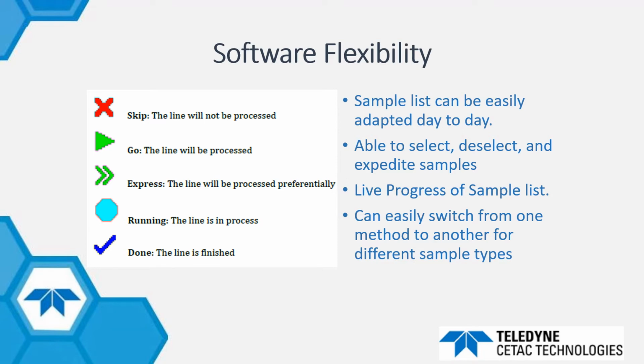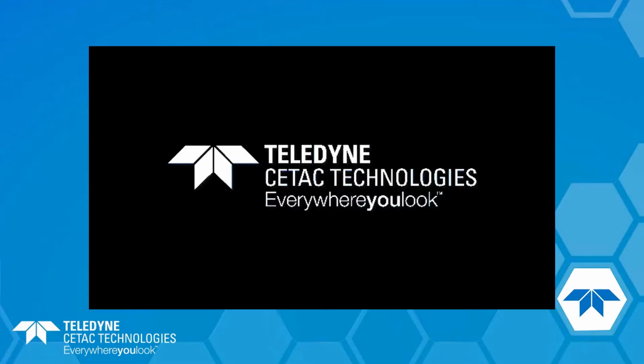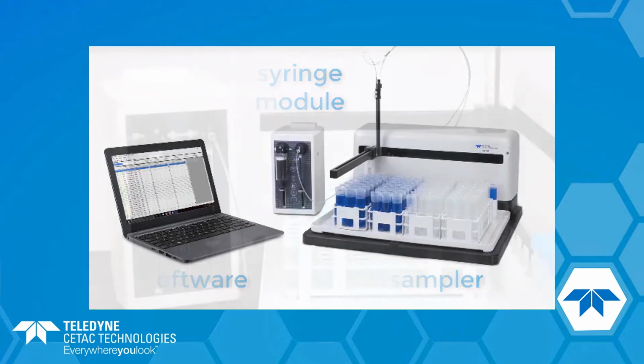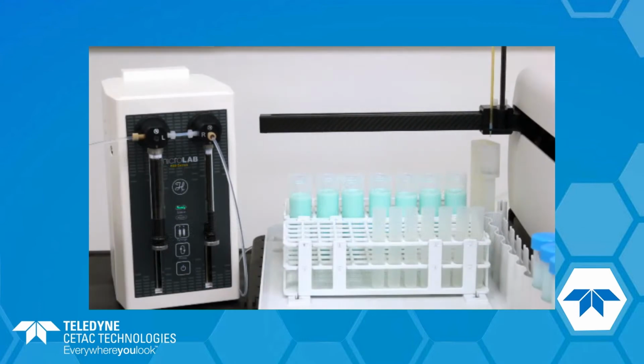And the sequences are designed to be method specific, which means that you can very easily switch from one type to another simply by loading a different Excel file and opening the sequence that's going to be my ultra clean, as compared to this other type of sample preparation that I'm doing. This is a brief video that shows the components of it here and shows the system in action.